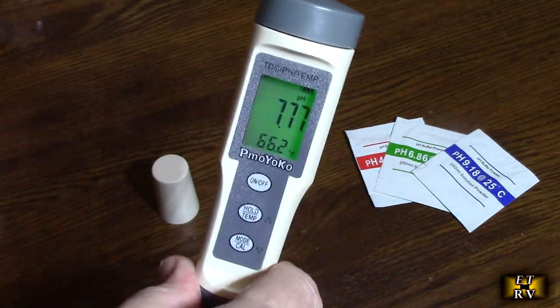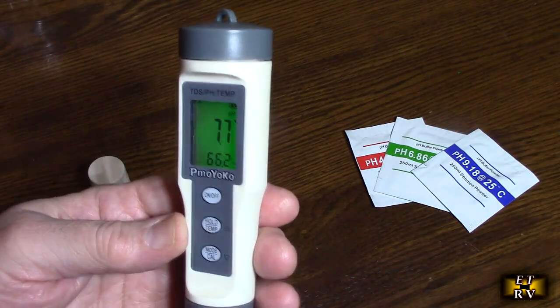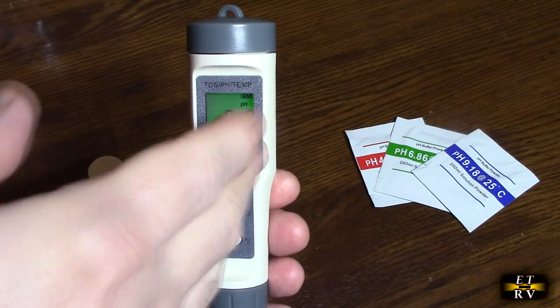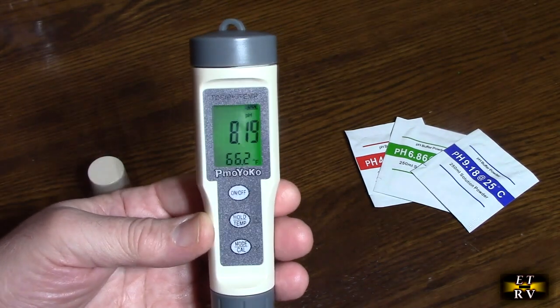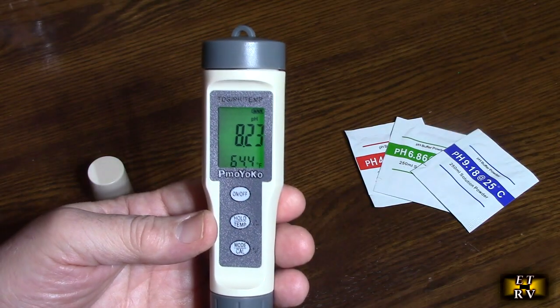If you're on a diet where you're worried about the acidic level of the food you eat also, you could test the foods and see the pH level. So this is like having a pH test script but not having the wastefulness of that. And this is going to last for a really long, long time.